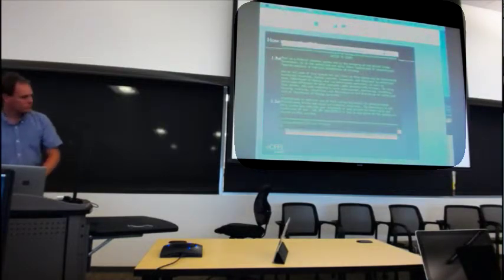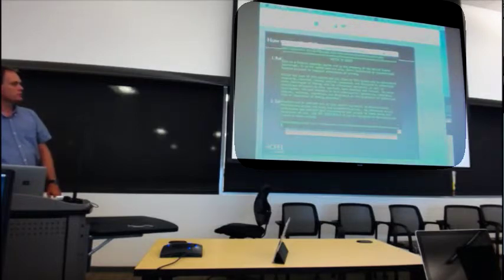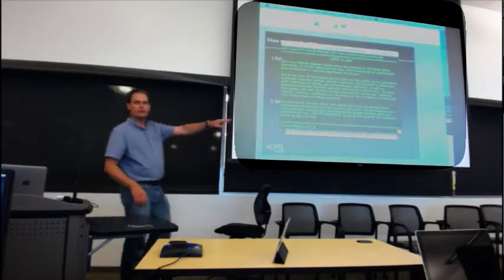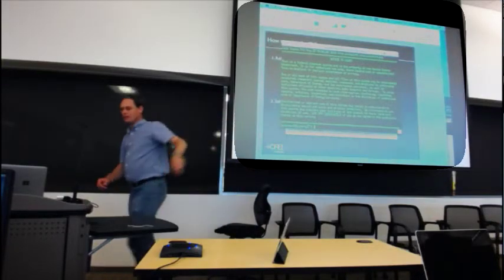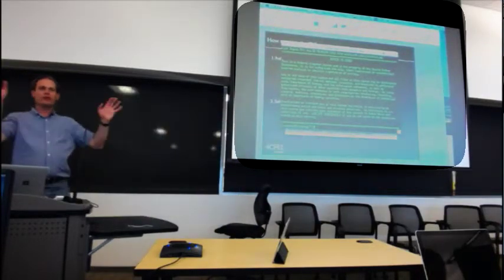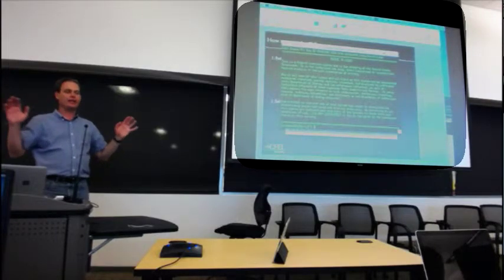Yeah, I use that. Okay, so you should be able to SSH minus X into PSANA here. These experiment names always confuse the hell out of me.